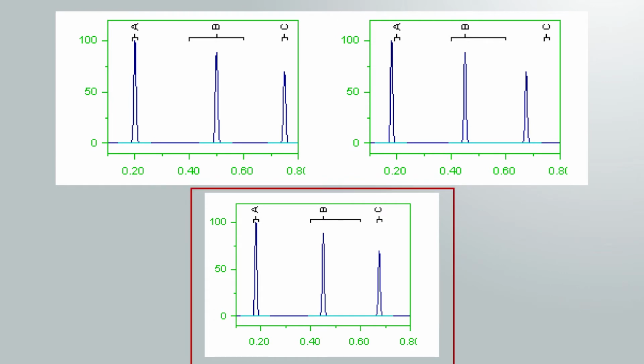The figure below shows the same chromatogram with retention time referencing to component B. Here the windows for components A and C have moved along with the peaks, and all peaks are correctly identified. The retention time scheme works only when the source of the variation in retention times affects all the peaks equally, that is, in proportion to their retention times.